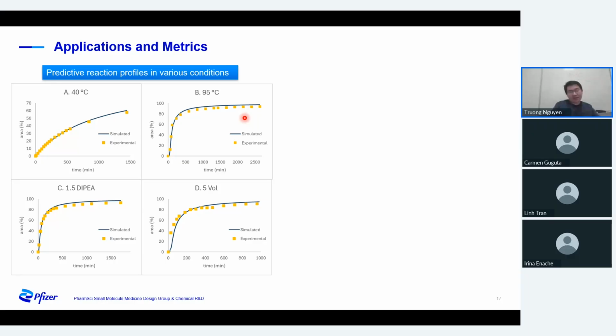in terms of practical benefits, because at the time, 4 or 5 years ago, we thought that this reaction would speed up if we ran at higher temperature. To prove that, because we didn't have the model or anything at the time, obviously ReactALL did not exist at the time either, we set up a very complicated reaction setup to run the reaction at superheat conditions to prove the hypothesis.